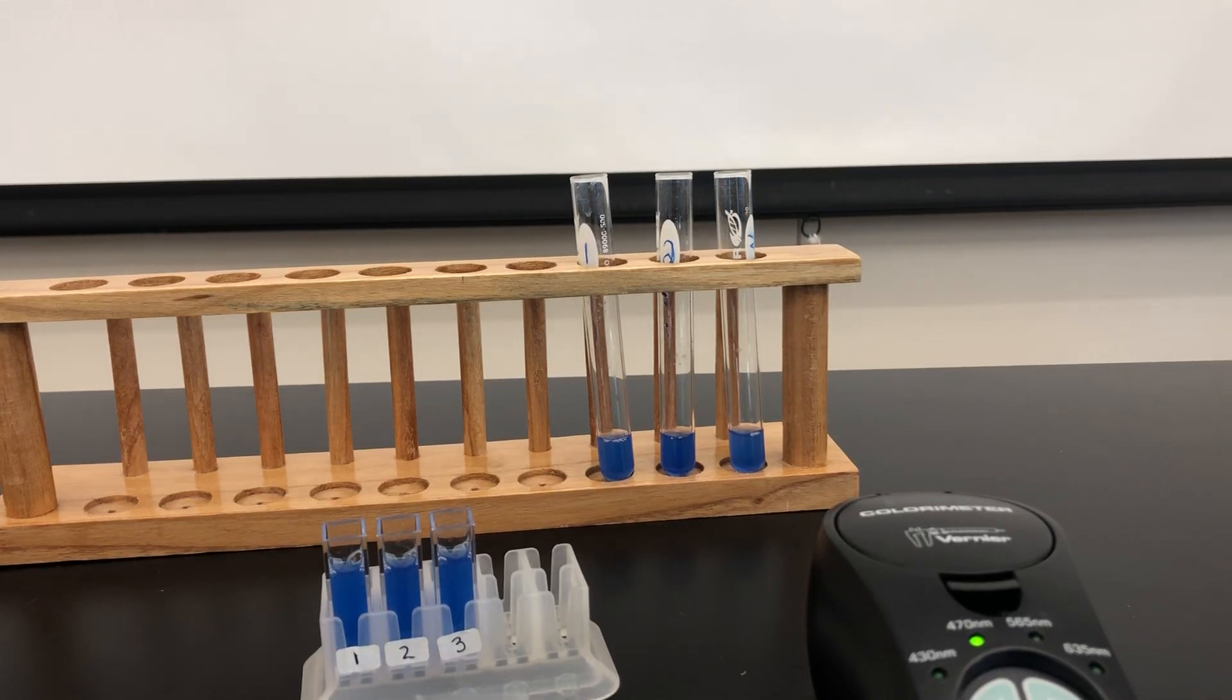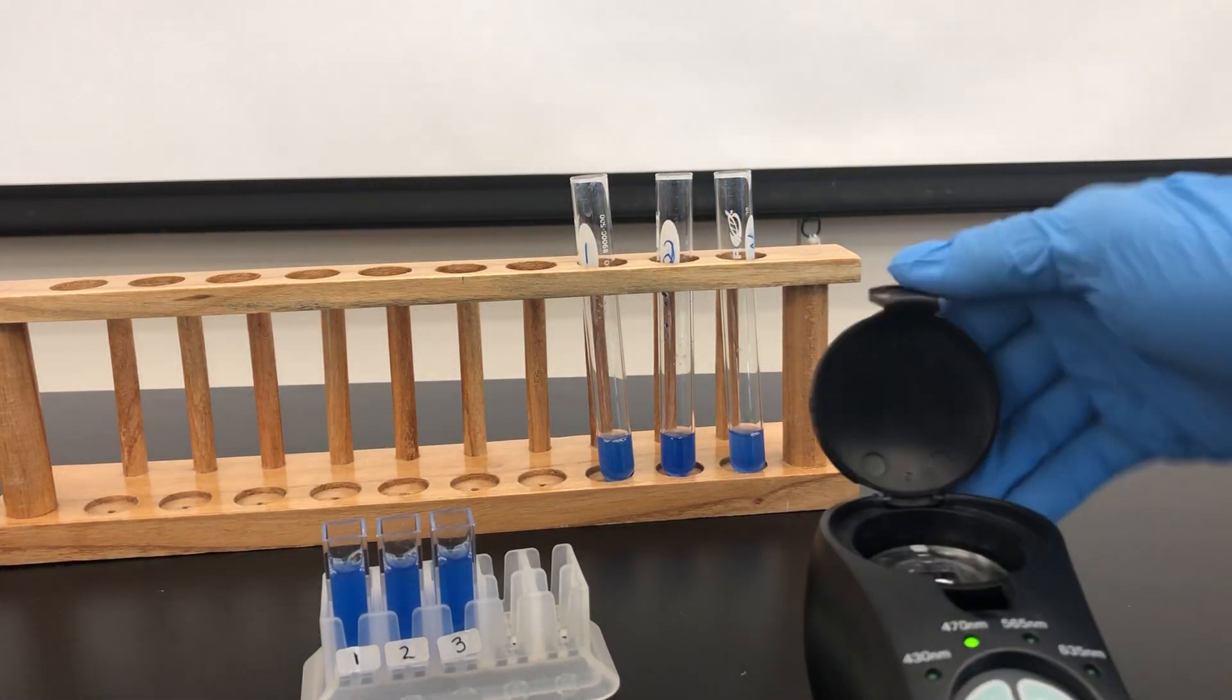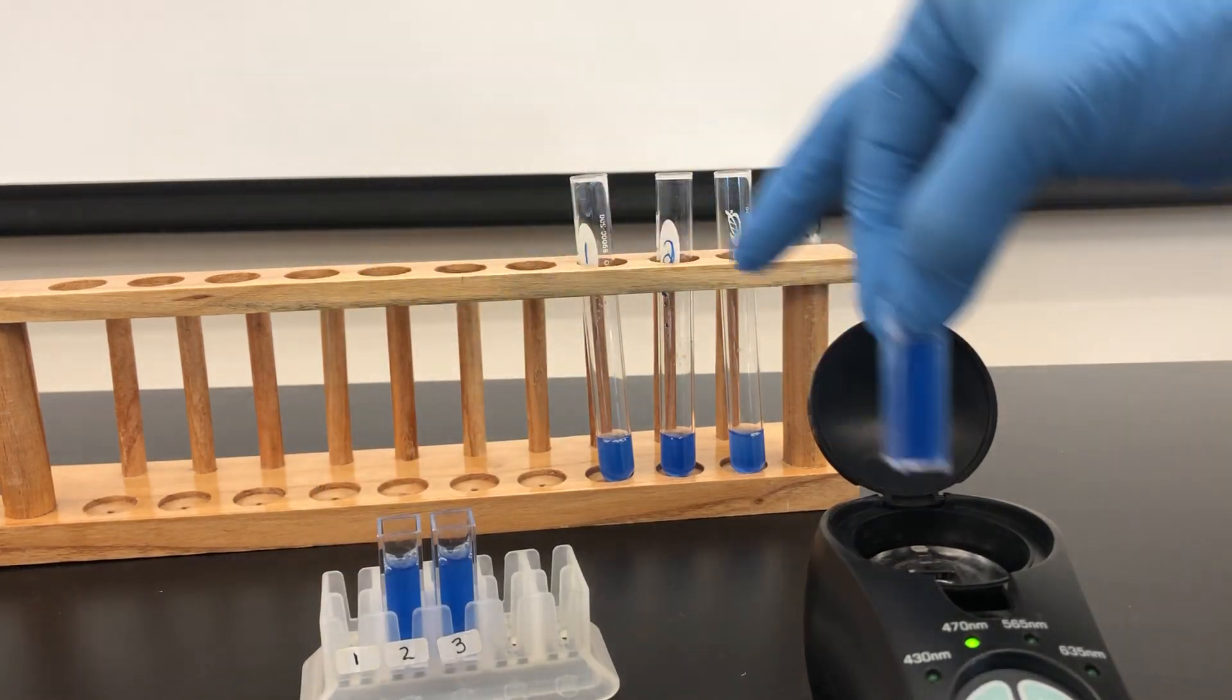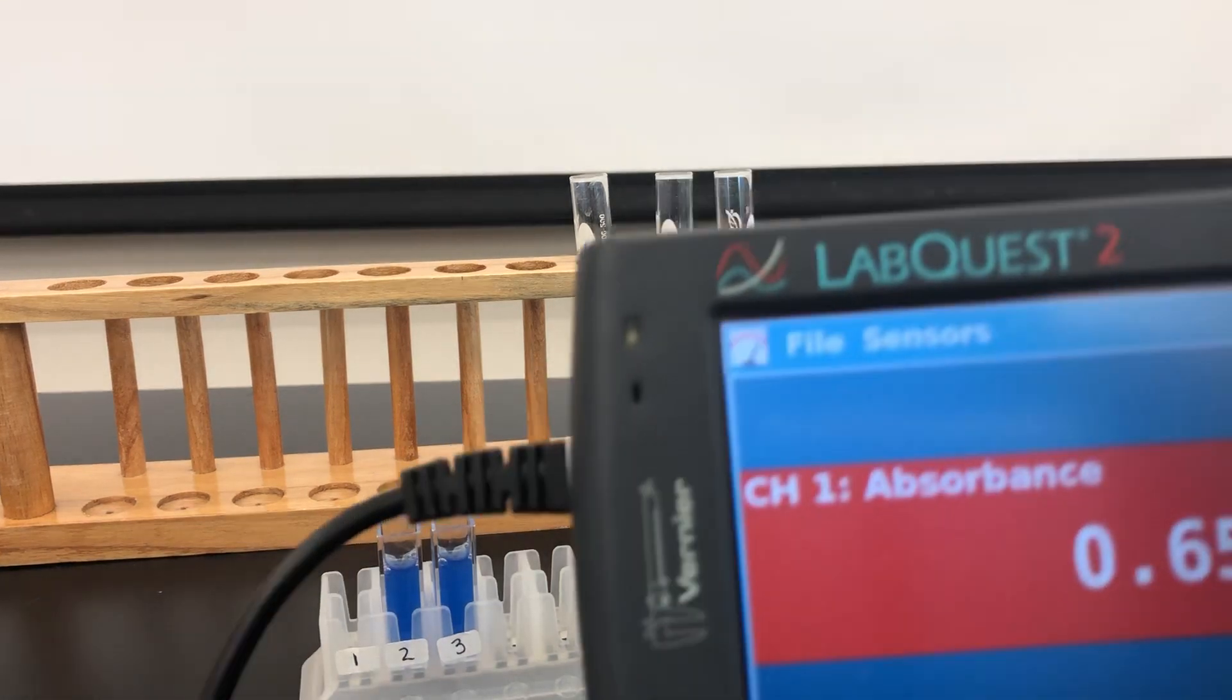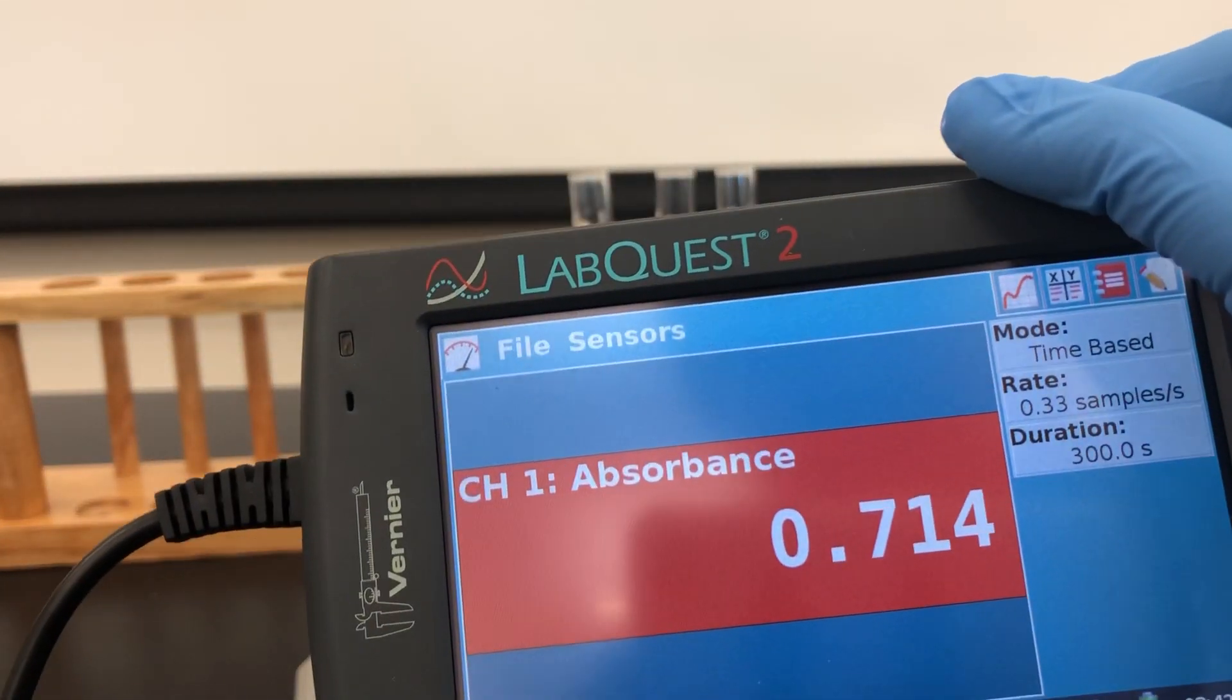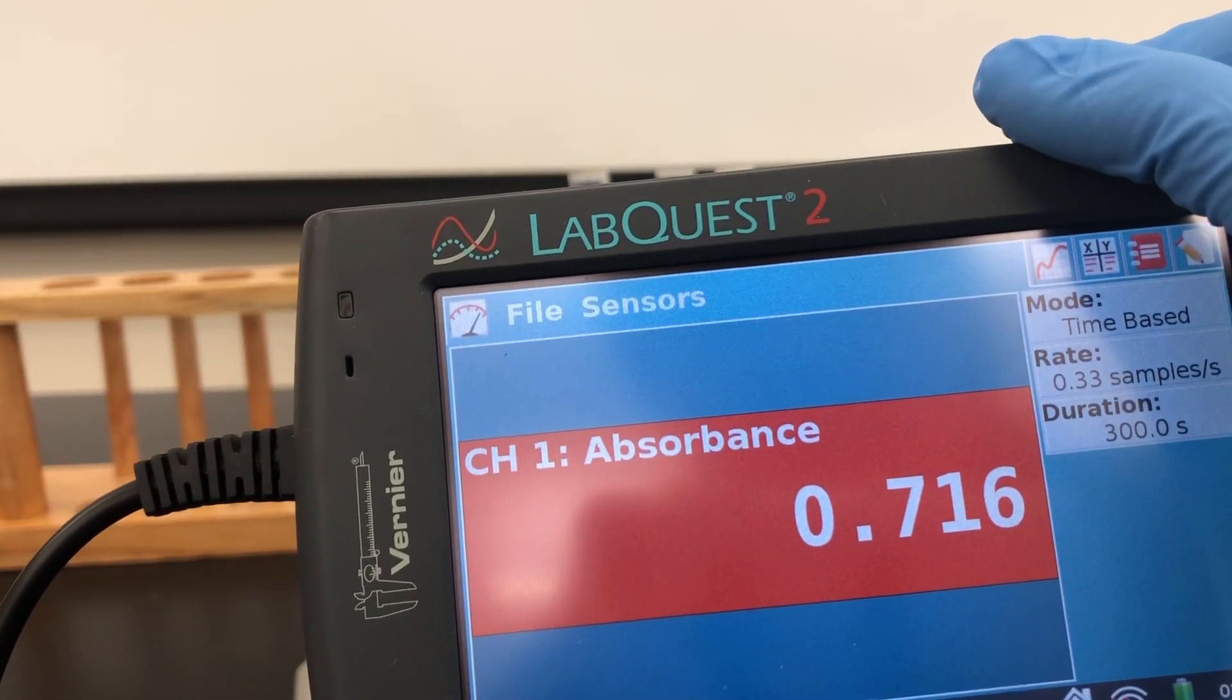Five more minutes have passed, so we'll do another reading. Tube number one is 0.716.